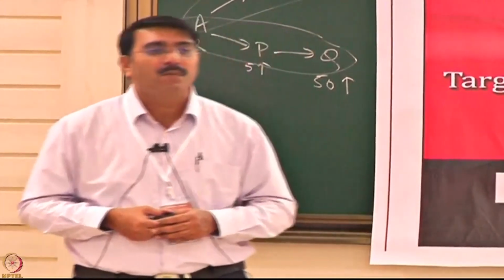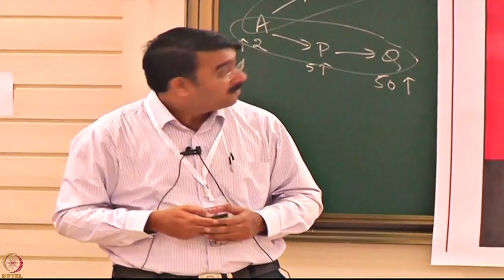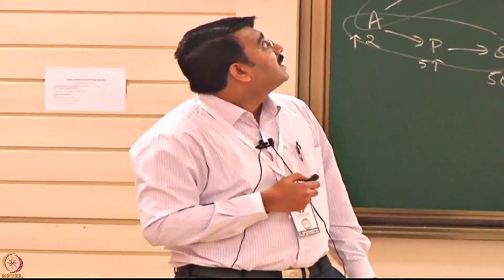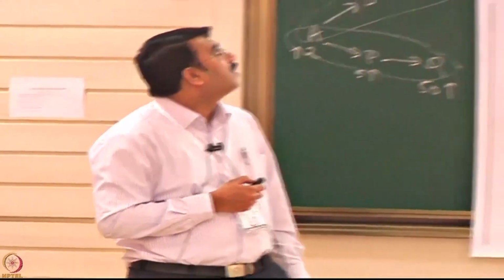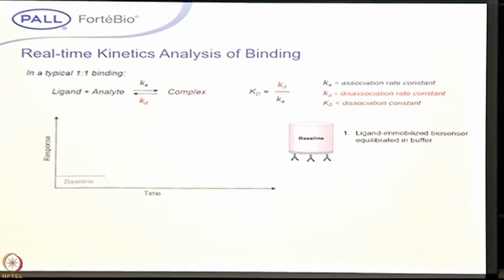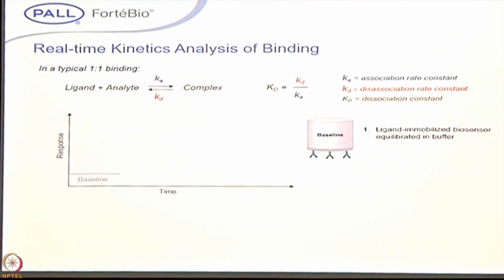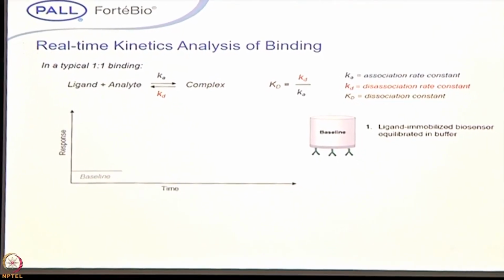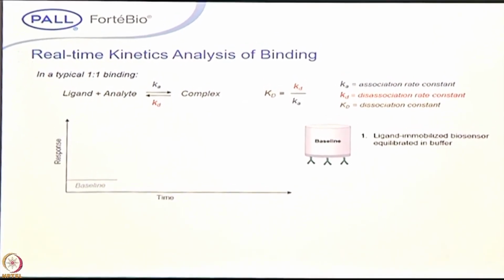So why people are moving to the label-free platforms is where you can get, this is the typical example, when there is a ligand, say suppose the compound A and the protein A and the protein B, this forms a complex, and this is the forward direction. When the complex formation happens, finally it will dissociate to once again A plus B. So these label-free interaction platforms are applicable to the reversible kind of reactions.